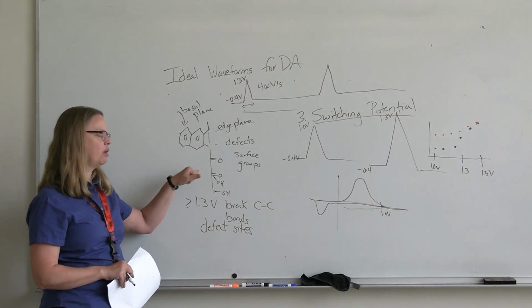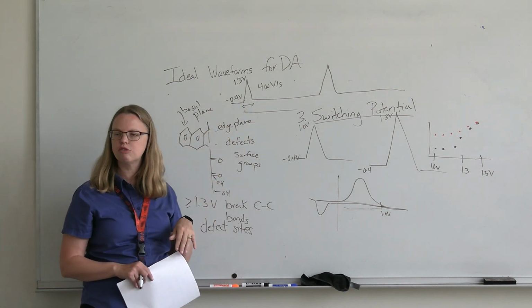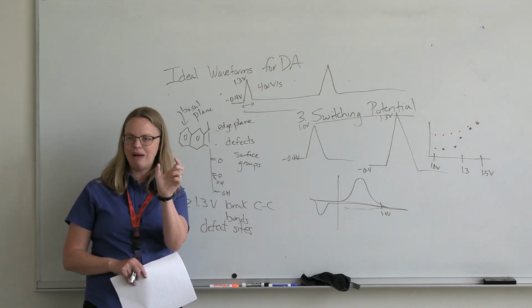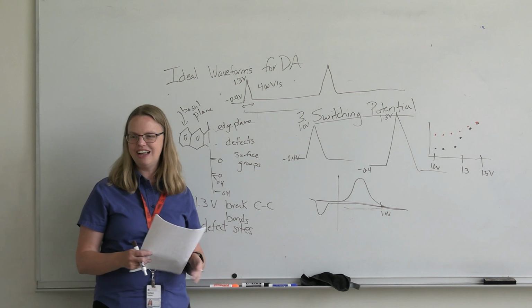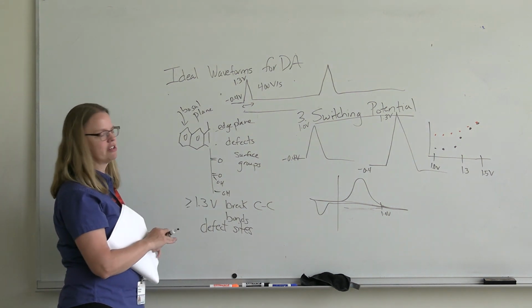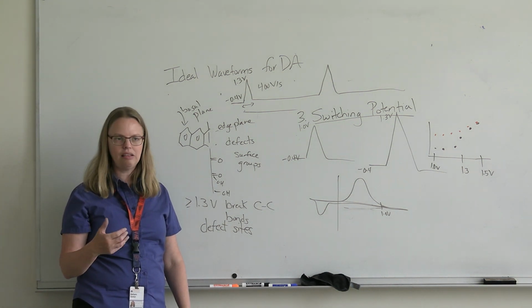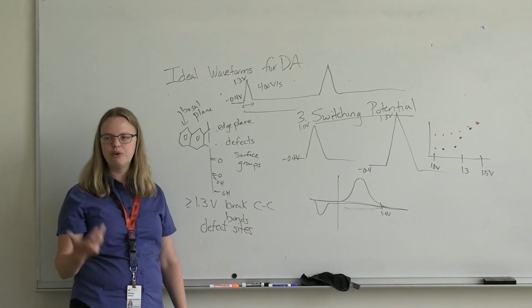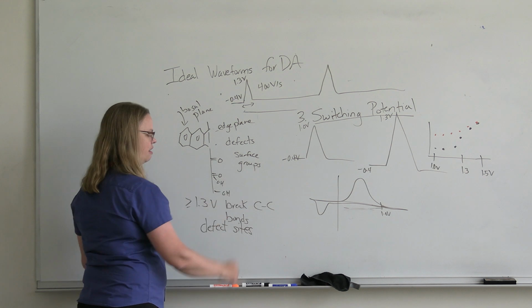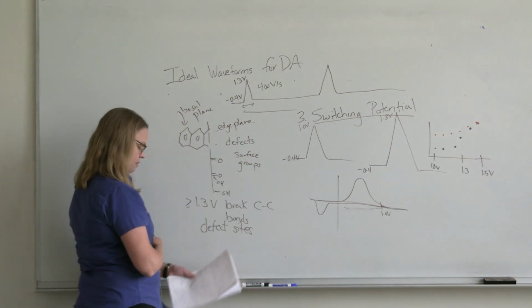Theoretically, Whiteman held the electrode at this potential for two or three days, and the diameter decreased by half, because you keep breaking carbon bonds and break off little bits of carbon. It's kind of amazing that you can break off the surface. This is really special about carbon electrodes, and we're going to exploit this a lot in carbon electrode development in FSCV. It was discovered to be a special property of carbon electrodes.